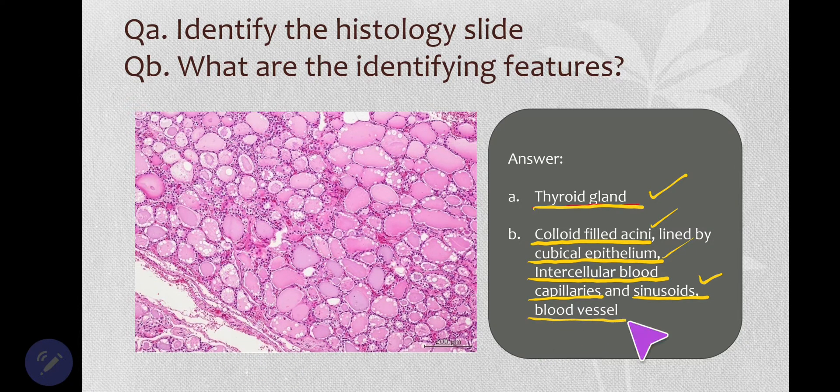So these are the identifying features of the thyroid gland.